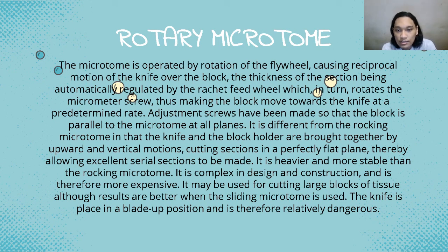in that the knife and the block holder are brought together by upward and vertical motions, cutting sections in a perfectly flat plane, thereby allowing excellent serial sections to be made. It is heavier and more stable than the rocking microtome. It is complex in design and construction and is therefore more expensive.